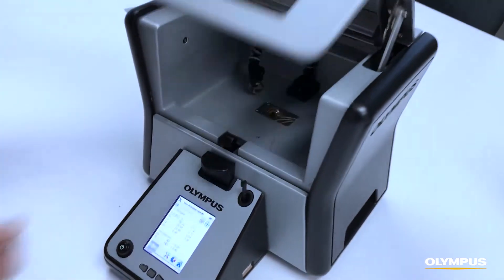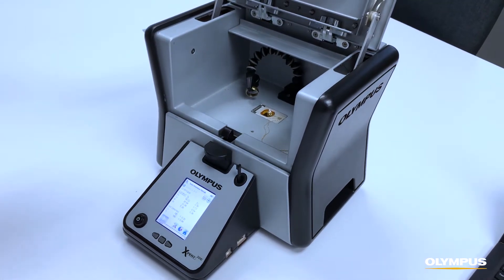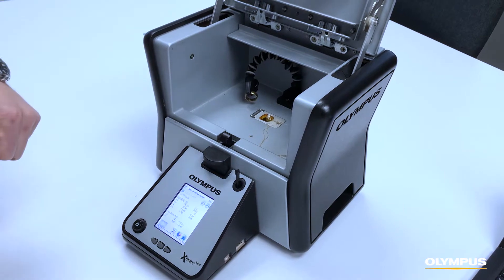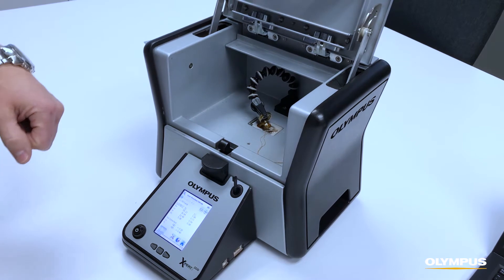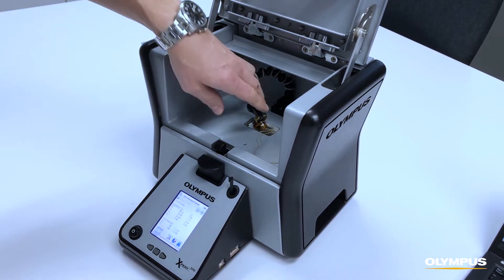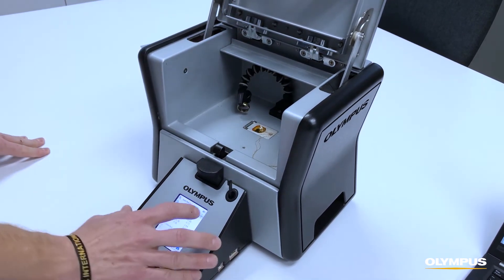You simply place the sample inside the chamber, close the door, and start the test. We have a sample holder for things like earrings, necklaces, and rings, so you can position the sample, and you pair this with our aiming camera feature on the analyzer.